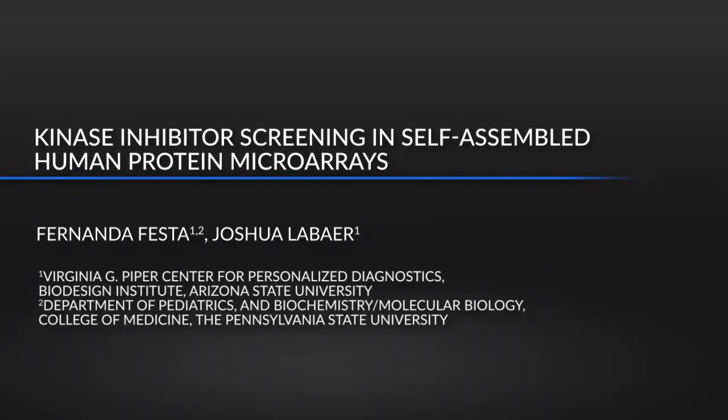NAPA is a powerful protein microarray platform that can be used for the study of protein activity and function in an unbiased, high-throughput manner. The proteins displayed on NAPA are produced in a human-based expression system using human-derived ribosomes and chaperones in order to improve the likelihood of natural folding and activity.